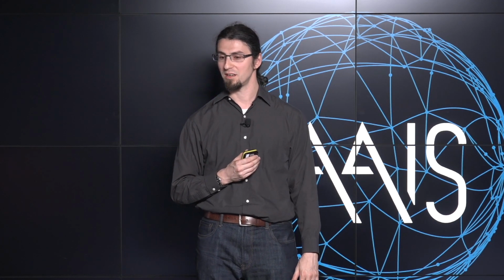You can't just move a single slider. You have to consider a space of many different capabilities. And the design space that one could choose from is enormous. And so we've built tools that help our scientists to do the design of experiment that leads us to the most optimal plate model that is as predictive as possible of our larger scale fermentation systems.